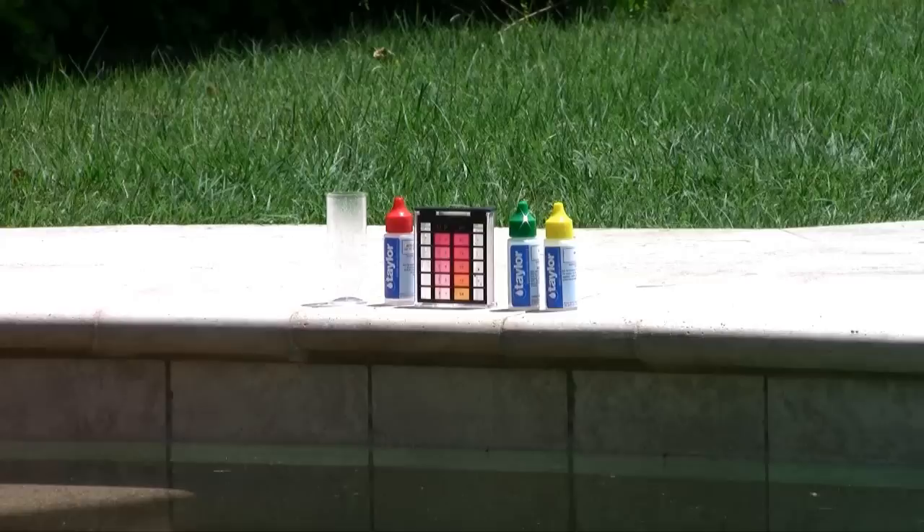Hi, I'm Peter with Leslie Swimming Pool Supplies, and this video will show you how to use a water testing kit. During the swim season, we suggest you test your water at least two times per week.